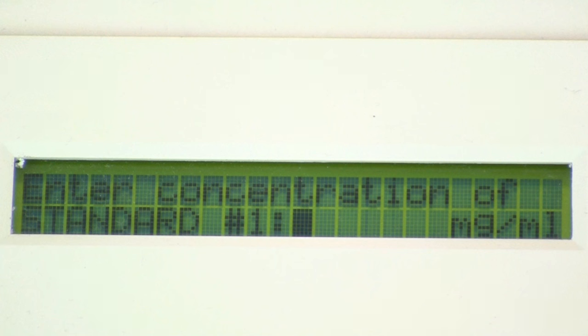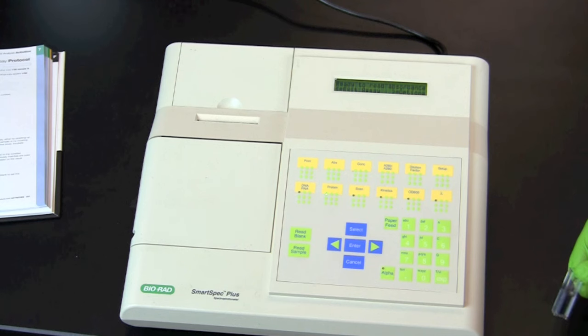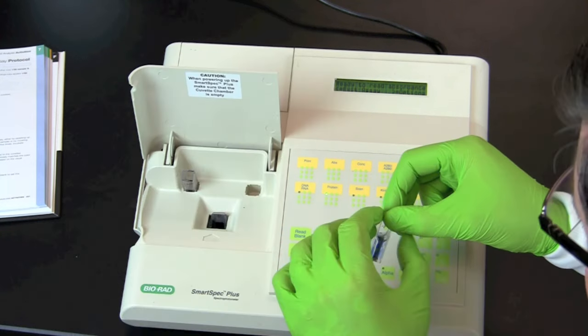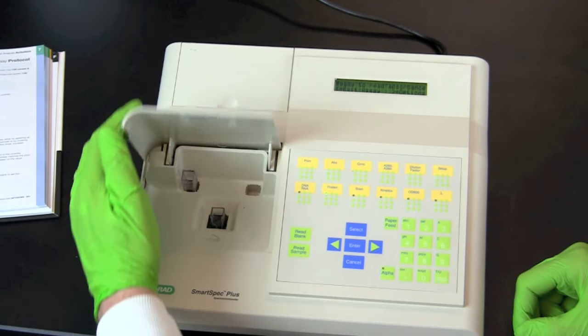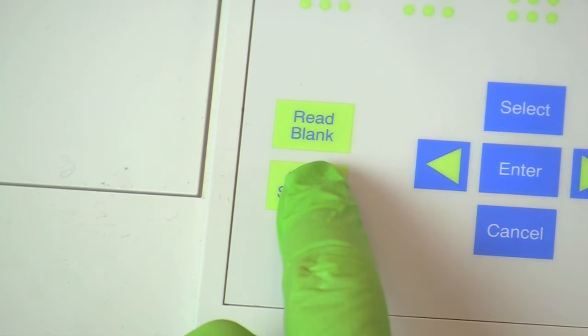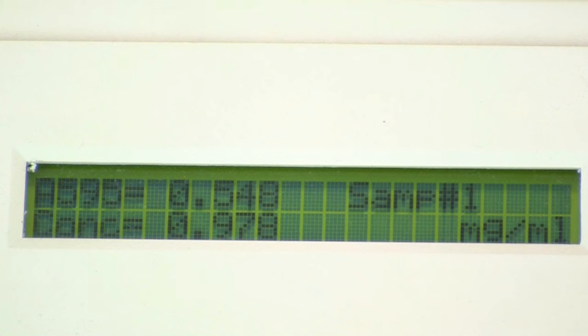If instructed, read the absorbance of the 7 protein standards and record the absorbance values. Remove the cuvette labeled blank and insert the milk sample into the spectrophotometer. Read the absorbance and record the value.